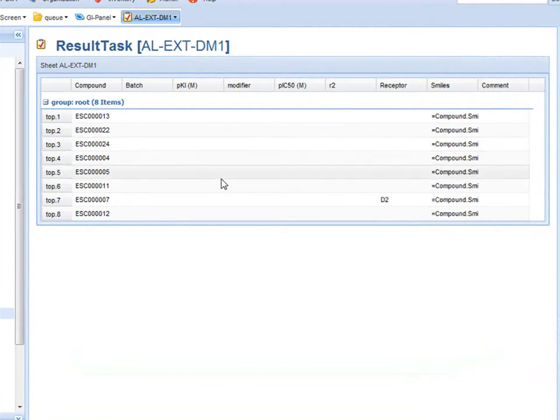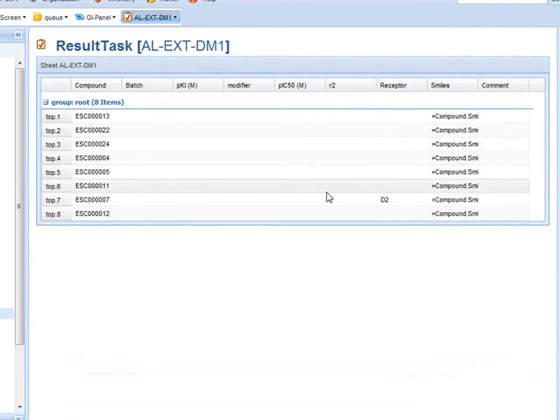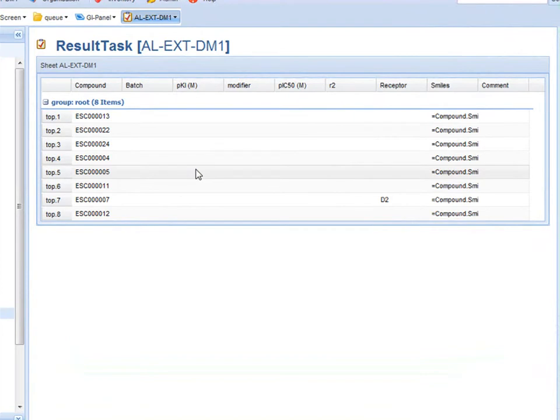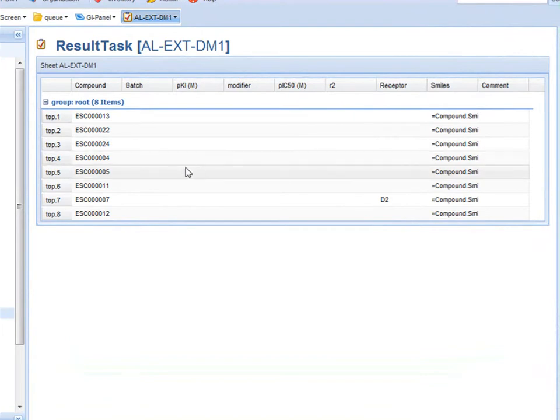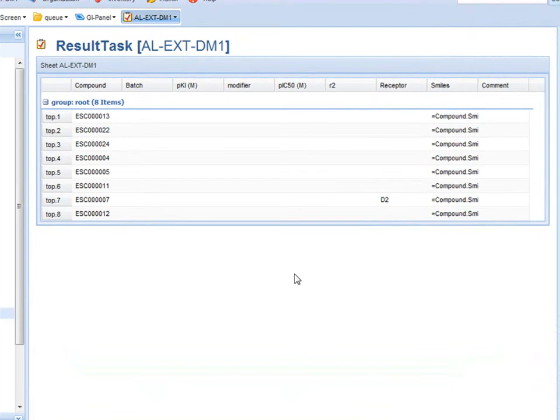What this does is provide an area or a data frame to post the results. At this point I can do one of two things. I could either run the complete assay within the BioRails LIMS system or I can make use of this data frame to post data from other systems. For example I may run this experiment in a third party LIMS.